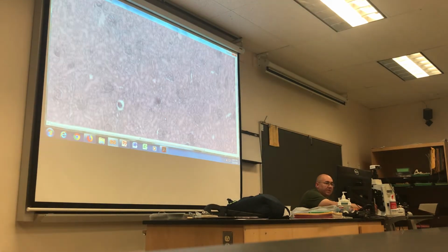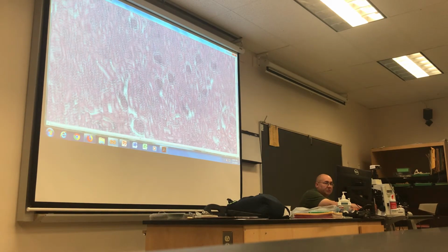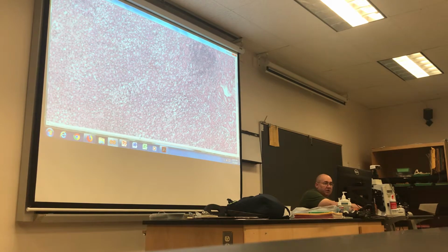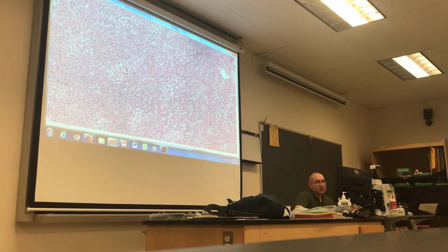And if we go ahead and move on inside, we just see more and more meatballs as we go through there, right? And eventually we end up in an area, no more meatballs, right? Kind of a sad plate of spaghetti. So what we have left here is just a bunch of little tubes, right? And when you look closely at the tubes, you see simple cuboidal and simple squamous, right? So when we just see tubes, where are we? In not the cortex, but the medulla, right?